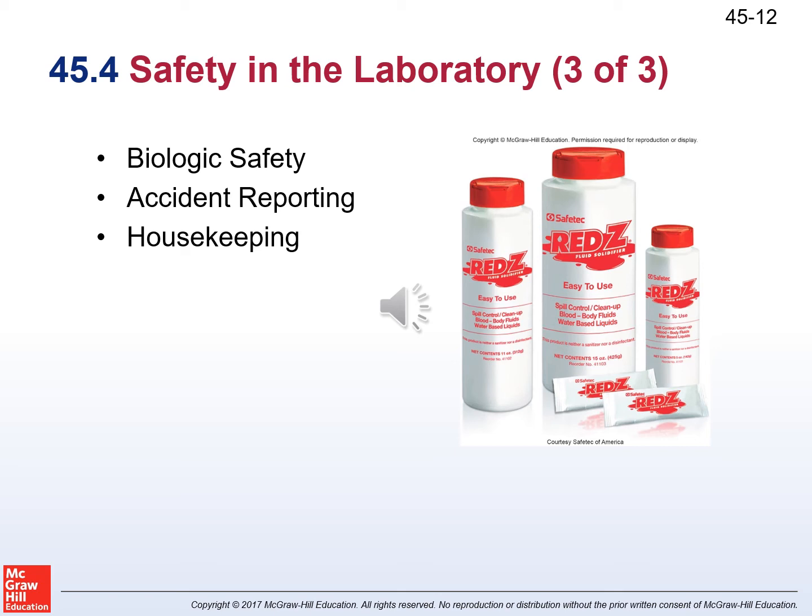Housekeeping duties are designed to reduce the risk of serious contamination in the laboratory. Each office will have written policies and procedures to ensure housekeeping duties are done correctly and according to schedule.